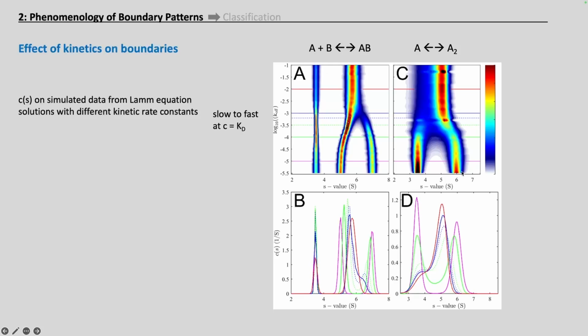Now, it's easy enough to imagine what's happening. On the time scale of sedimentation, all protein copies rapidly exchange their state between monomer and dimer in a rapid association-dissociation equilibrium. While they are monomeric, they sediment slowly, but when they are in a complex, they sediment fast. And what we see macroscopically for the ensemble is just their time average S value.